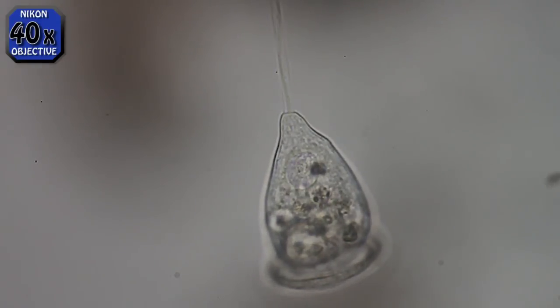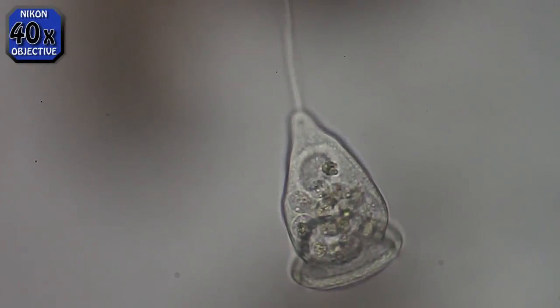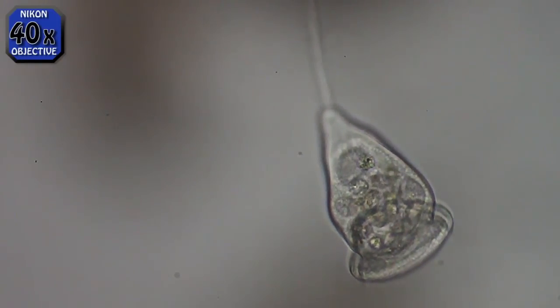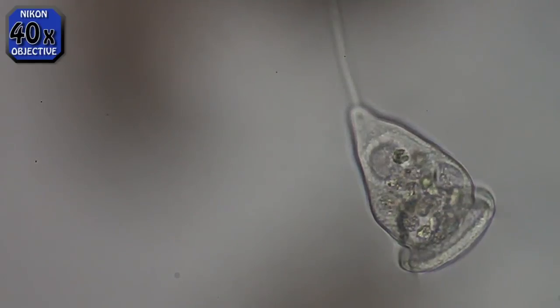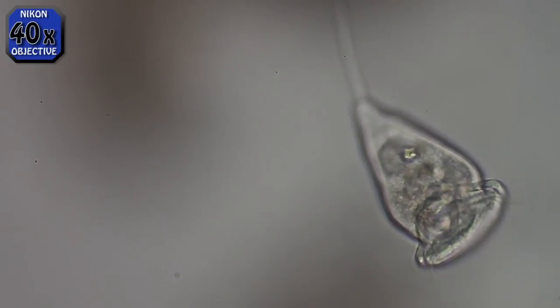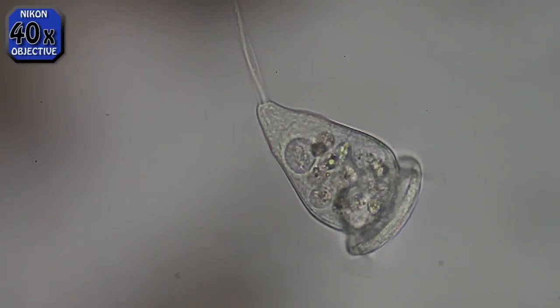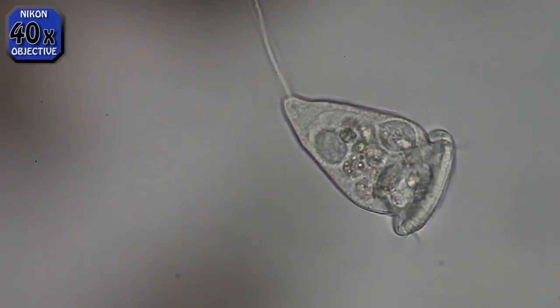Is that the macronucleus there at the top? It's curved like a banana along the bottom of the body — I've read that's their shape. It's out of focus now. And there it is again. Kind of a greenish color. Let's see how it comes from the Acromat lens.